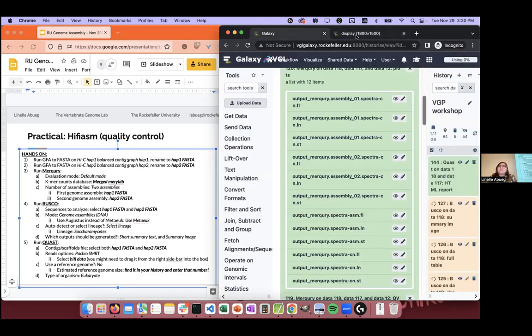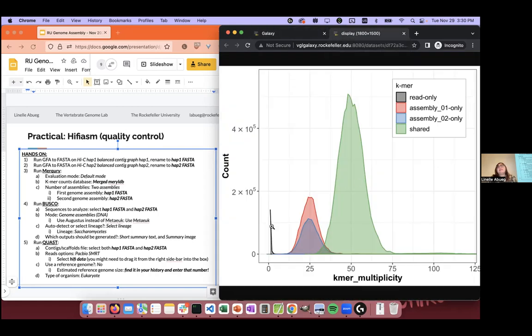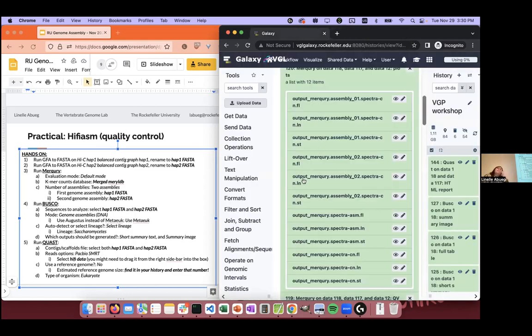So this just really shows the strength of using Hi-C phasing. We don't have to fiddle with any purging. We just have our nice phased haplotypes, nice complete assemblies right out the gate. I've had to purge maybe once or twice in all of this. It should be the same for a trio phase. For a trio phase, you can also.